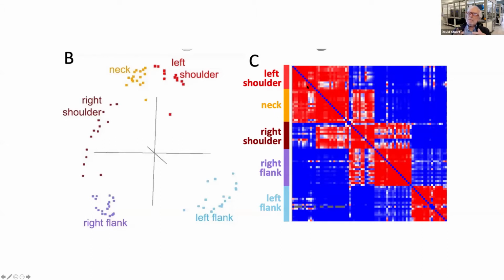And then Helen Ginn, who was a student with me and is now a Diamond postdoc, very recently published a paper in Acta on a clustering algorithm for clustering essentially stuff that comes out of the XChem screening program. She applied that clustering algorithm to the competition results and reordered according to cluster. So here, red means strong competition.